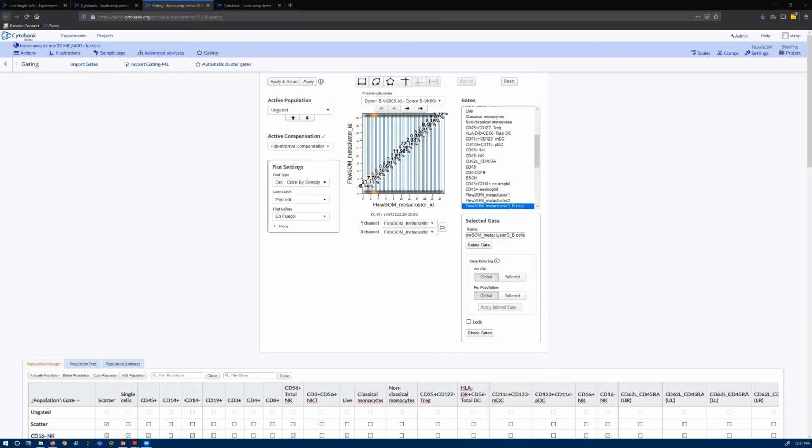Yeah, sure. Actually, I'm just curious why you might want to do that, because the whole purpose of the clustering algorithm is to help you reduce the dimension of your data.